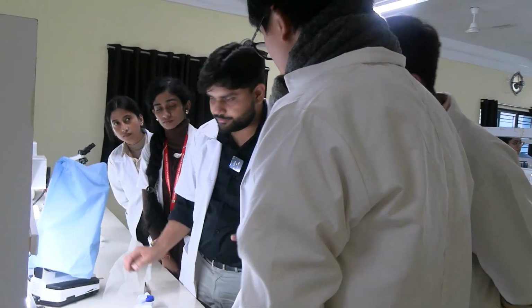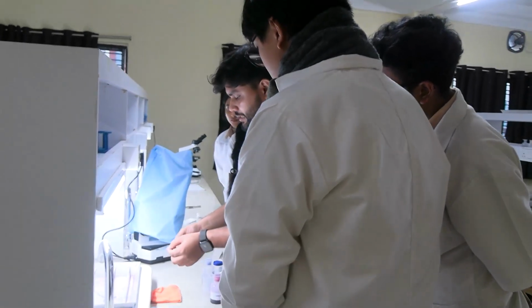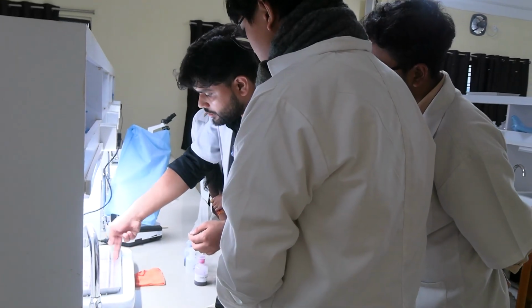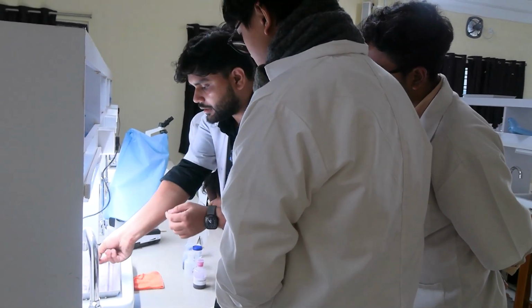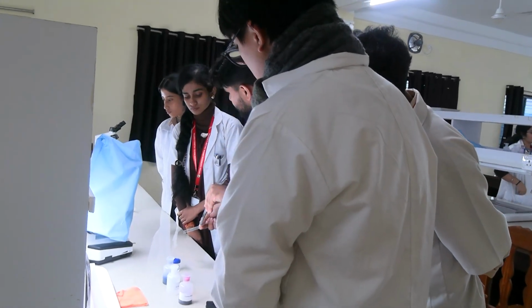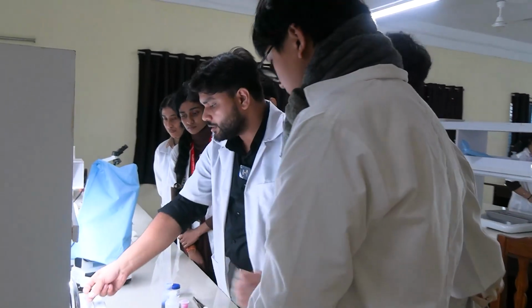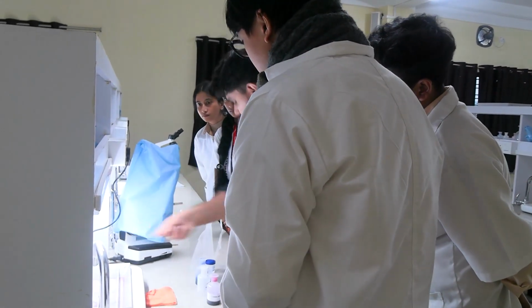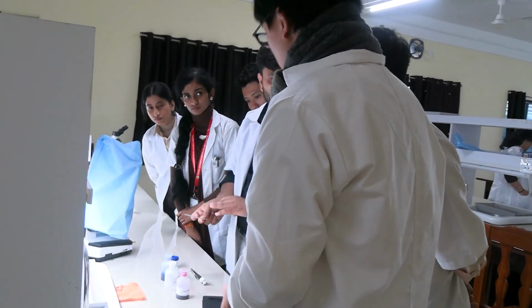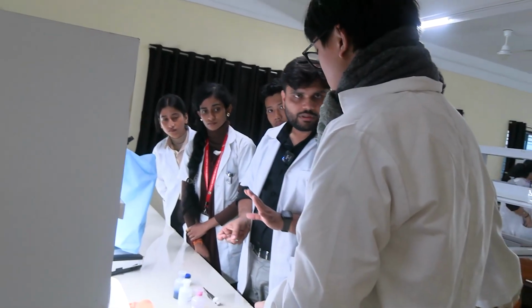Okay. Water. You can do this one also, or as there is some space here, you can also pick it up like this. Okay, you can keep it here and you can pick it up like this and place it under the water here also. Okay, so you have to pour the water here or on the slide, but never directly on the smear. Okay, and remember, while picking it up now, you should make sure that you are tilting it upwards like this. Don't pick it up like this, else everything will fall onto your hand, and this is a very dangerous specimen. Even if it's killed, it's still very dangerous.